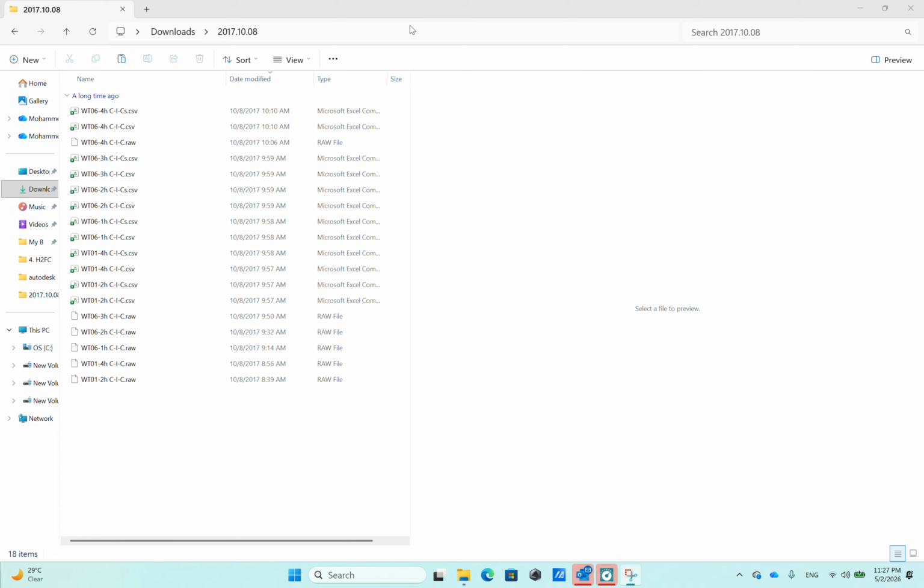Today in this lesson, I'm going to show you how to draw results such as XRD (X-ray diffractometer) results, chemisorption results, BET results, and so on using an Excel sheet. Usually, when we collect the data from an instrument, we use Origin to draw the data. But these data can also be drawn in Excel. And in Excel you can also do several modifications as you can in Origin, such as changing the format type, the font size, the color, and so on.